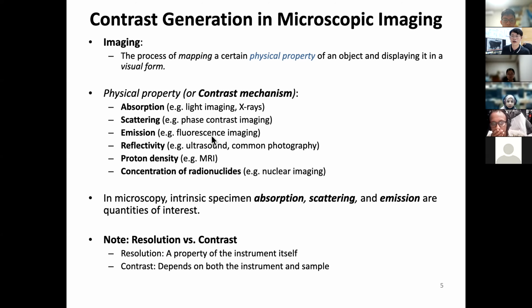That's also very important for the advancement of science, because you can give specificity to the molecule of your interest, emitting light of your interest, and that can even be colorful. That color gives you multiple pieces of information. So this is a fascinating one, and that process we call emission. Excitation and emission, I think we'll discuss later.